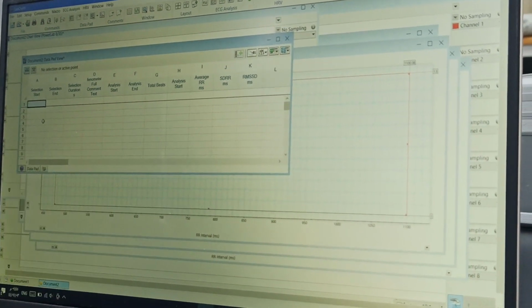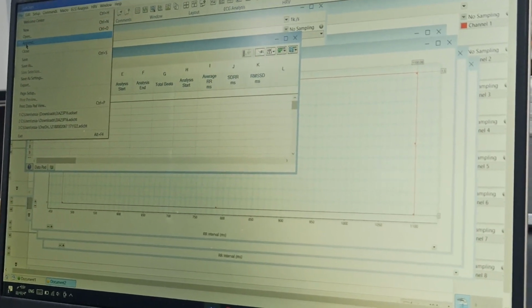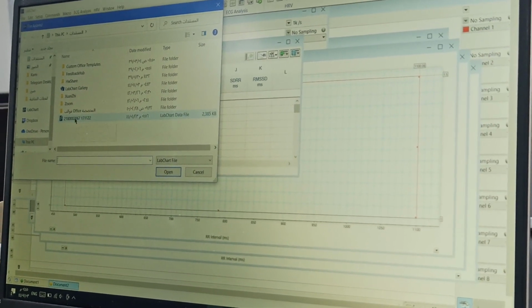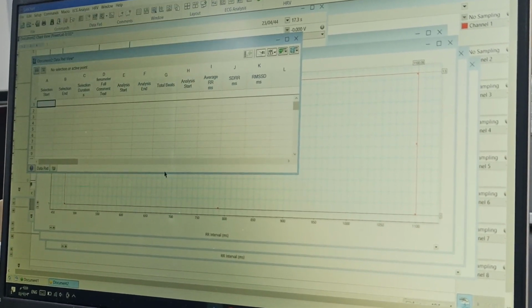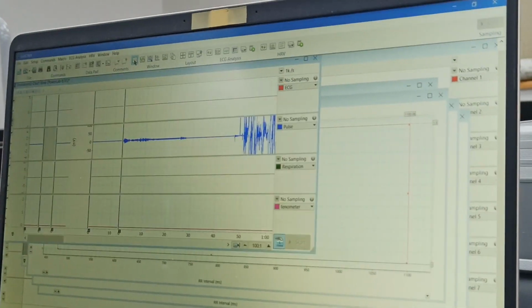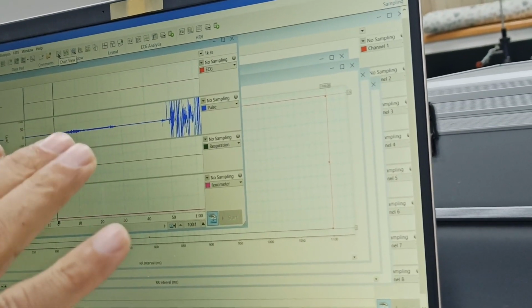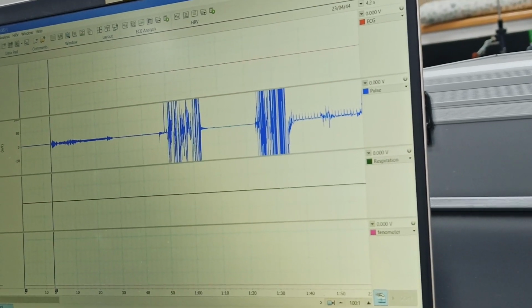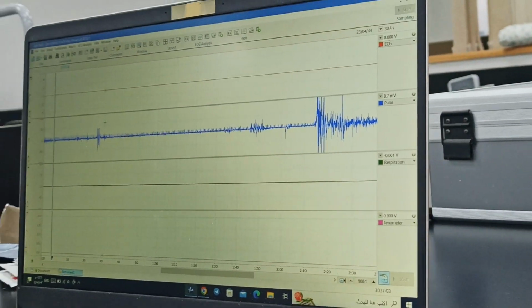So now it is the settings file. Now what I need to do is append. This one is the old one, so we'll append this file. And go to data. Let us see. This is the other file. It has been opened with this setting. Now let us see. Is there useful data somewhere? Yes, we have.